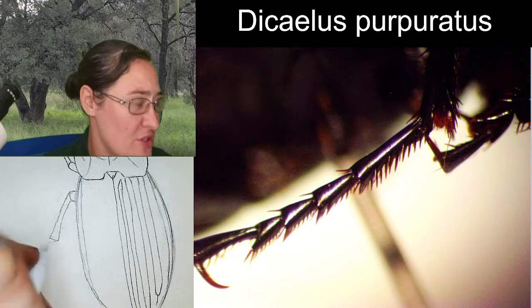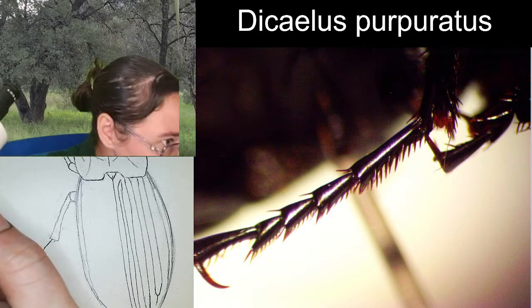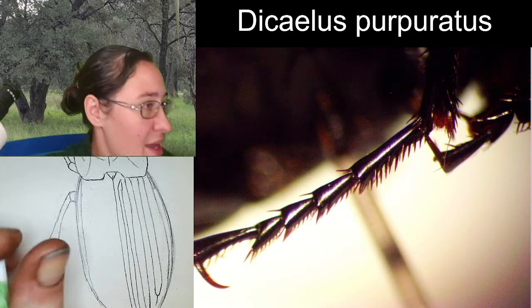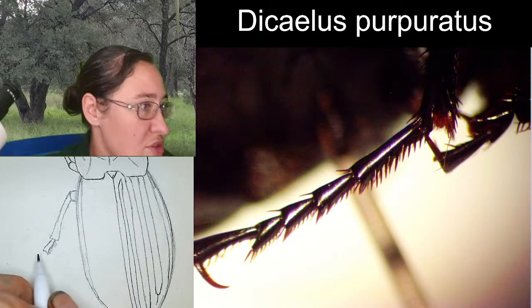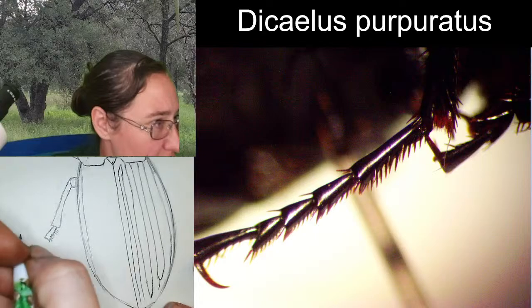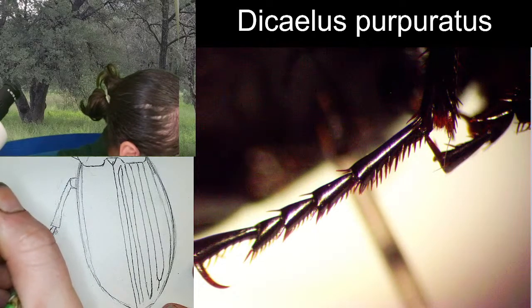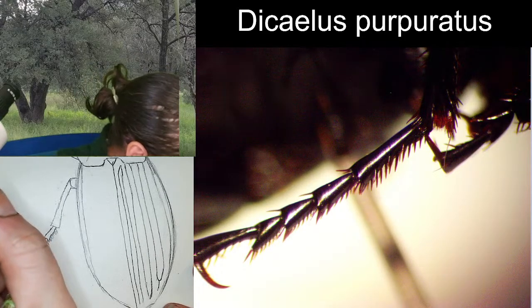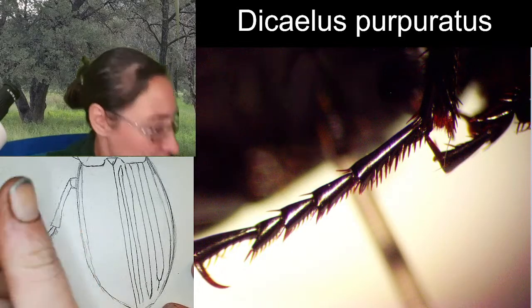Still five tarsal segments. Although this time, that first tarsal segment is nice and long. It's concave at the end, and then it has all of those bristles, all those hairs at the bottom to help it walk. The second tarsal segment is about half the length of the first one. And the next one is slightly smaller. See how small we need to get. And then one more.